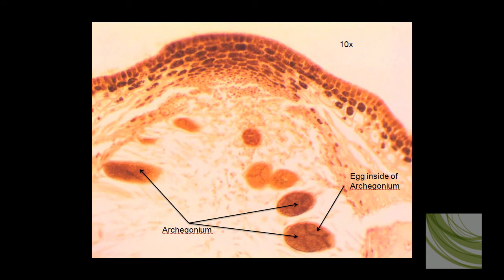Here, using the 10X objective on that last slide, we can now see these archegonium, and you can very clearly see eggs inside of that archegonium. We can also see very clearly the opening into the concepticle, which we call the osteole. This wraps up my discussion of the Fucus slide.